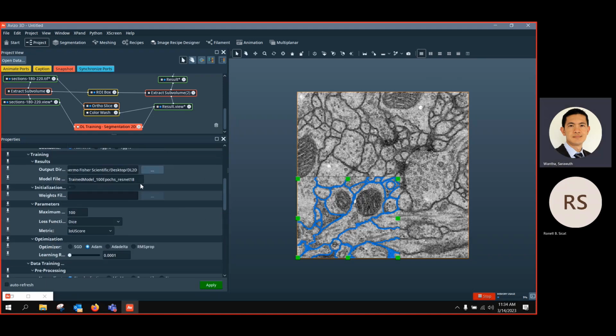So this would be the last piece of information: 128 patch. Any kind of name is fine, so long as you can remember all the parameters you input.